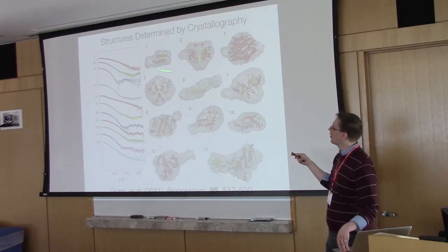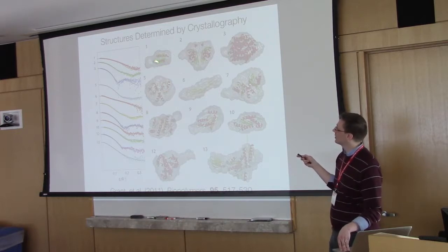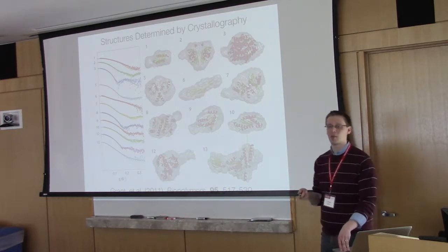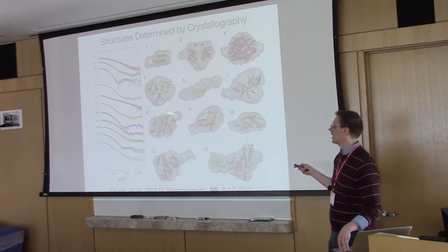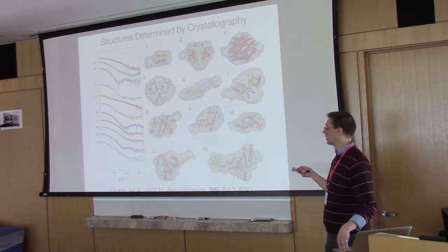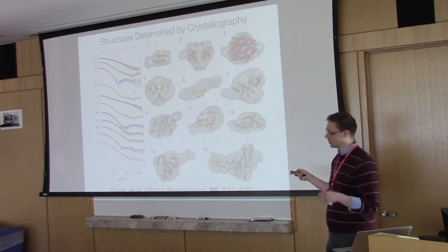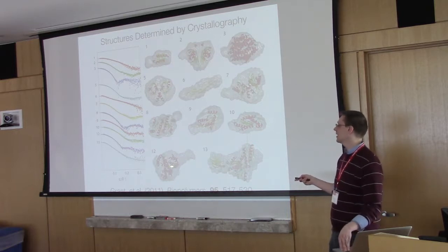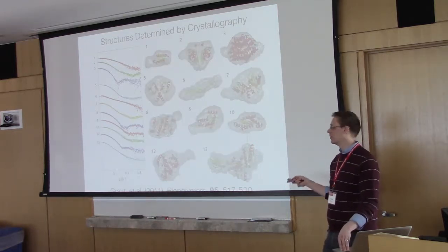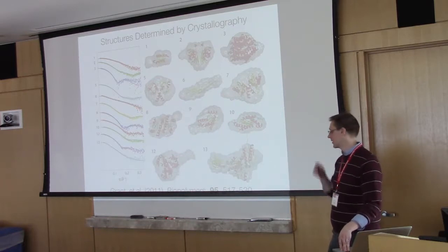Well, in the case of this one here, it actually was extra density, because where that terminus is, there's an extra 15% of the molecule or something like that. This case is aggregation because, for one, it's a dimer and it's not symmetric, whereas a dimer would probably be symmetric. If it was really extra residues that were not resolved in the density, you'd see it on both sides. And in this other case, it actually is the real particle, because there was about 20% of the molecule that was missing.